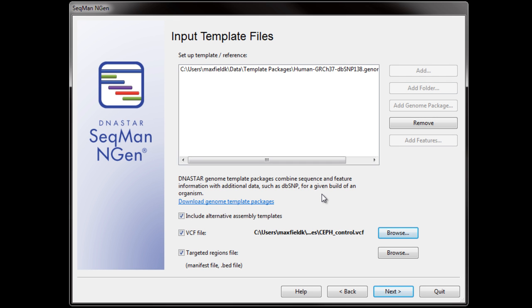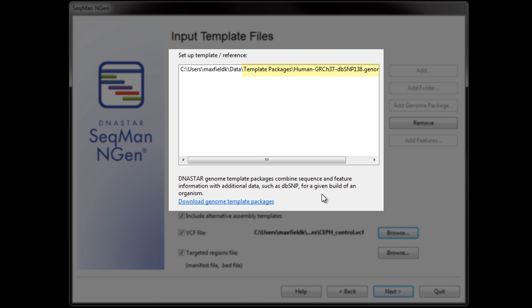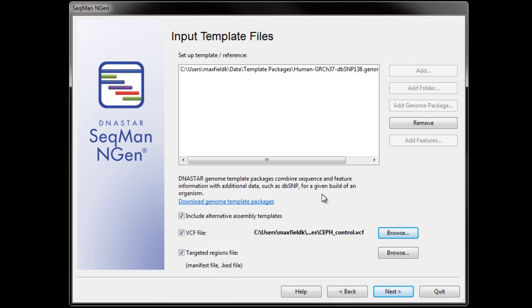Now, positions within the VCF file I have selected will be given a user ID during assembly. This ID will be visible in SeekMan Pro and ArrayStar. In this case, I am using a Human Genome template package for the reference sequence, so we will also have access to dbSNP information in our downstream analysis.